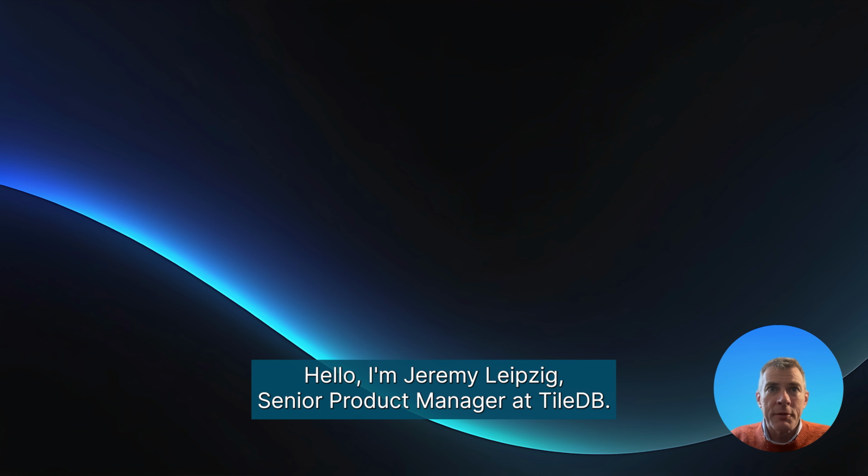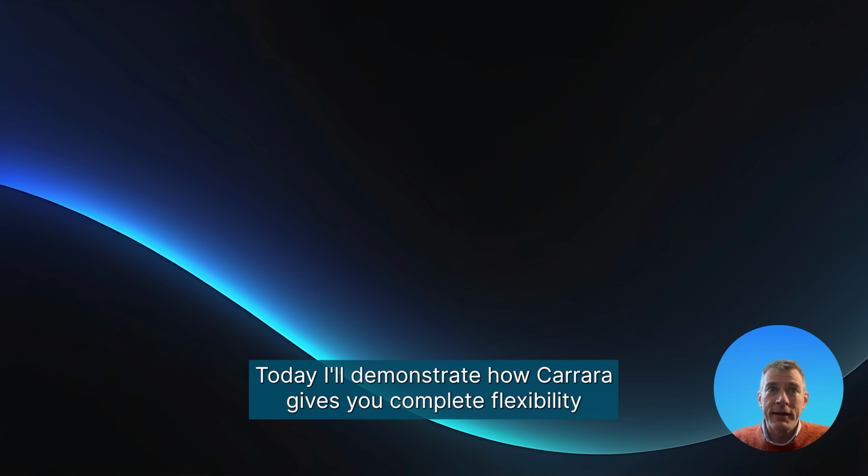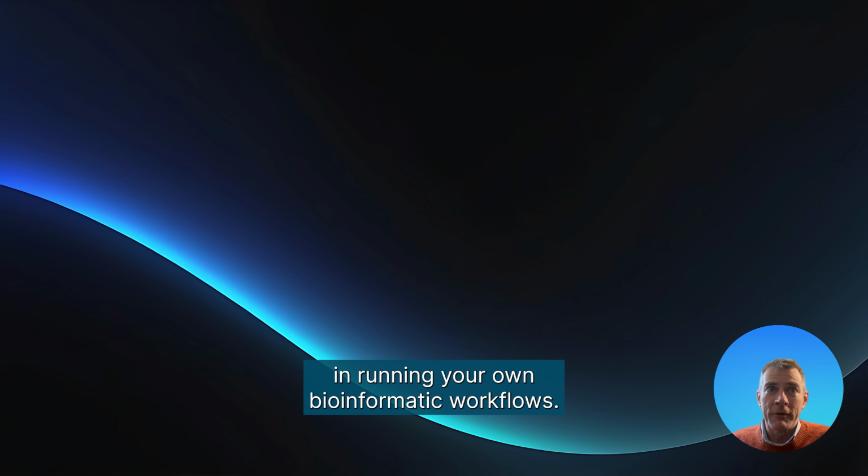I'm Jeremy Leipzig, Senior Product Manager at TileDB. Today I'll demonstrate how Carrara gives you complete flexibility in running your own bioinformatic workflows.